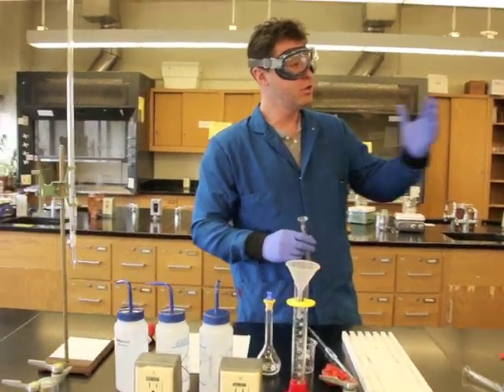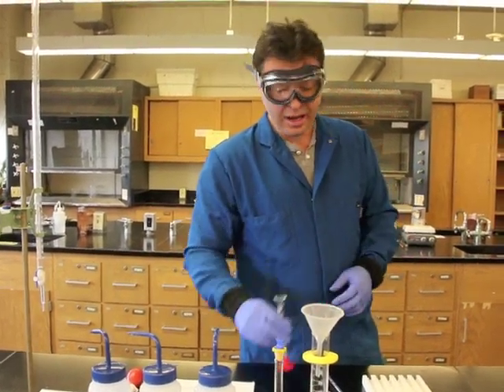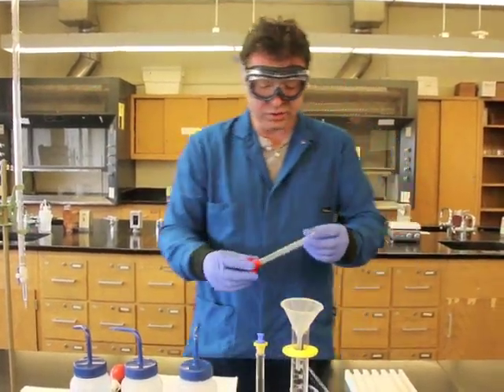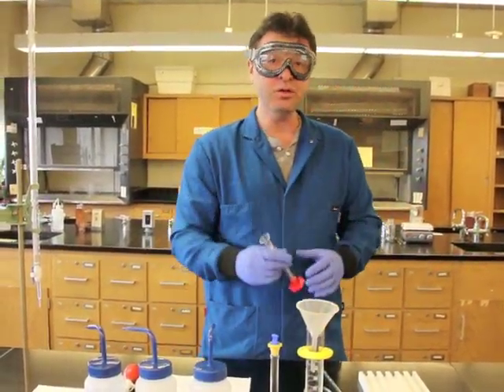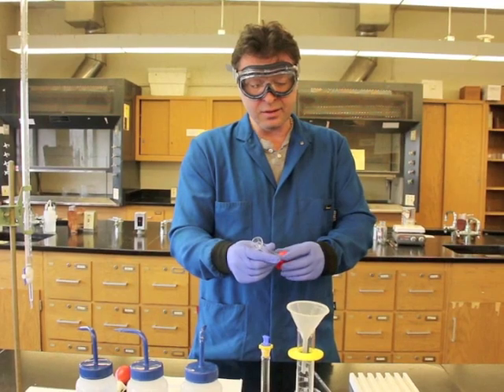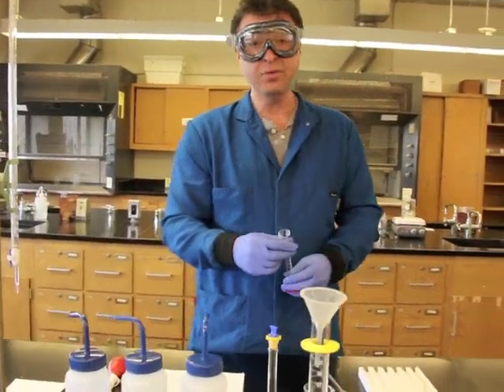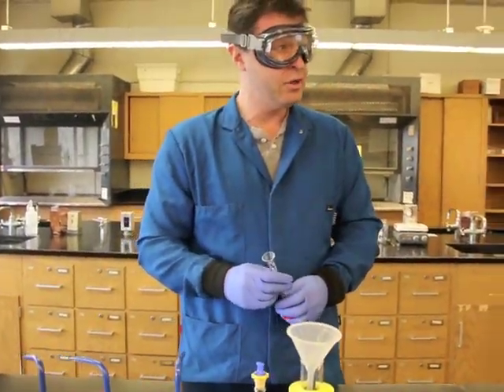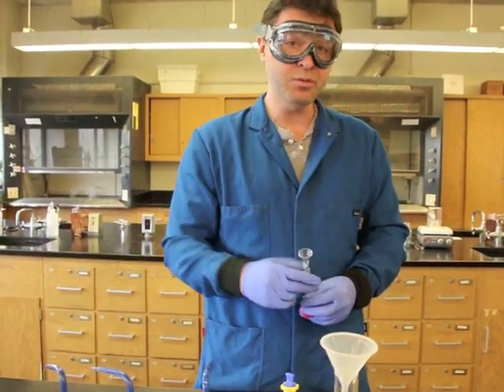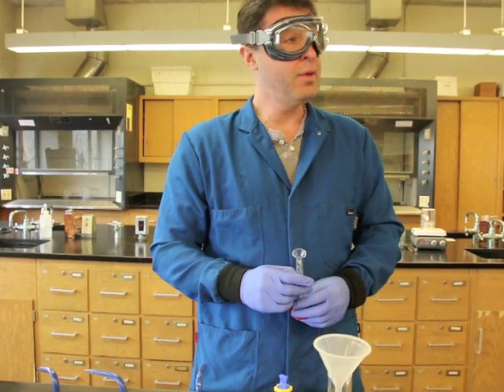When you examine this pipette, it's a class A equipment and it has a tolerance of plus or minus 0.02, so you're pretty much certain in the hundredths place. What we're testing here is which of the three volumetric glassware will give us more accurate and precise results. In the procedure, we describe accuracy and precision - accuracy is how close your measured volumes are to the true volume, and precision is how close multiple measurements are among each other.